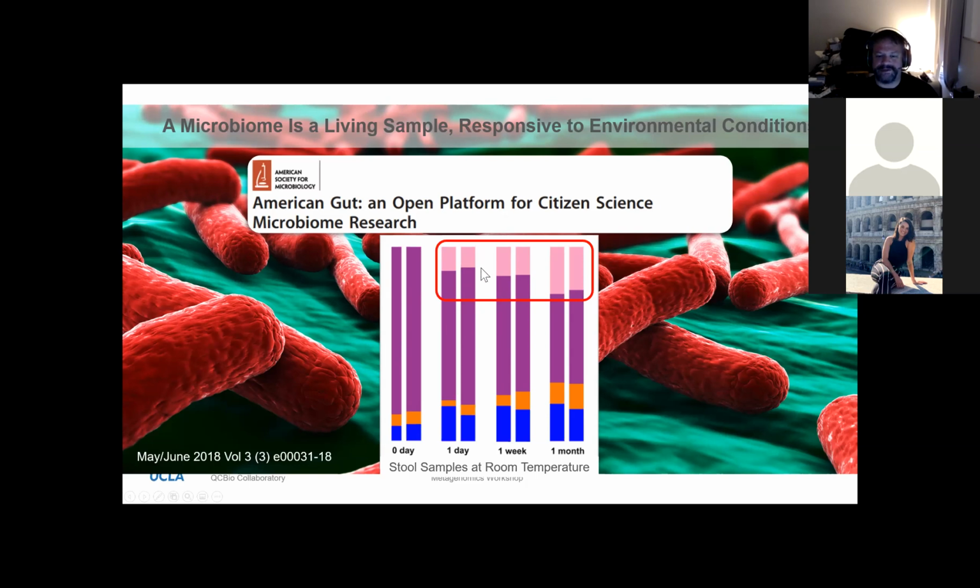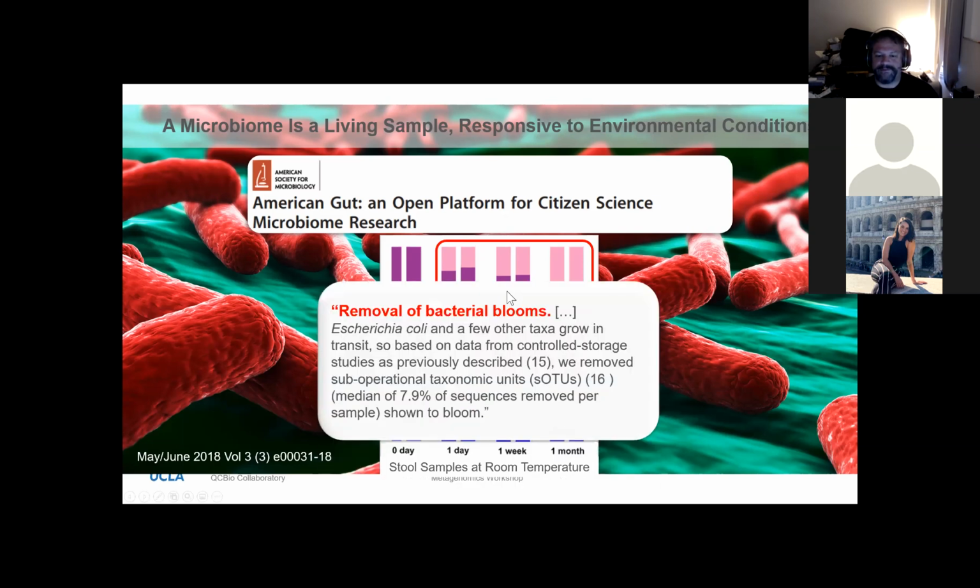It was painful for me to see this, because I get why they did it, and I think they were probably right to do it so they didn't have to get rid of a really big and otherwise potentially useful data set. But they ended up having to bioinformatically remove E. coli from stool samples, which obviously is not something you want to do.